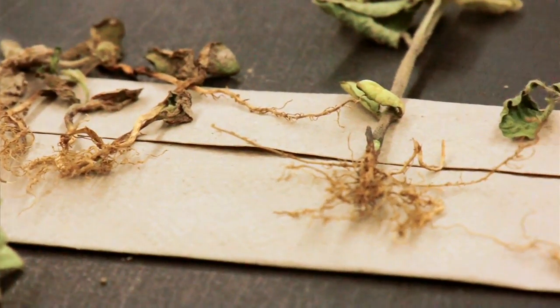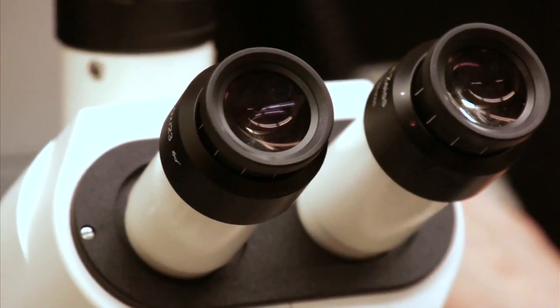Some other things we might do with a sample is actually take some of the root tissue and look at it under the microscope for other root rot pathogens. And then we will give a report to the client.